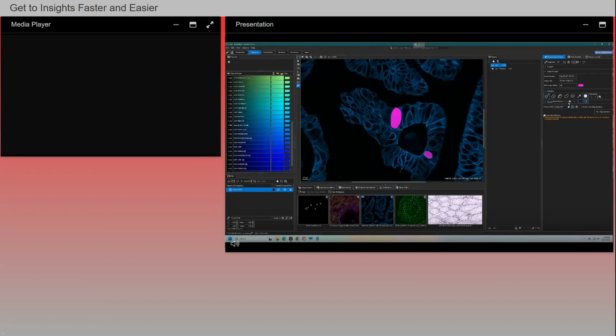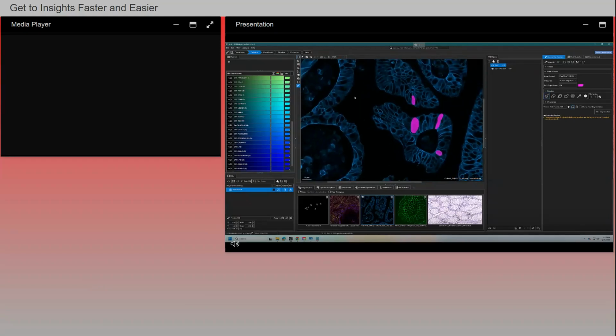between. And the minimum requirement we've set in our current algorithm is 5, just so that we can get the largest, the smallest, and the cells sort of in between. So here are some examples that I'm painting, and I'm not being super precise, and the only thing you have to remember is you don't want to be painting too close to each other, because then the cells will be merged and Aivia will think it's of one large cell.